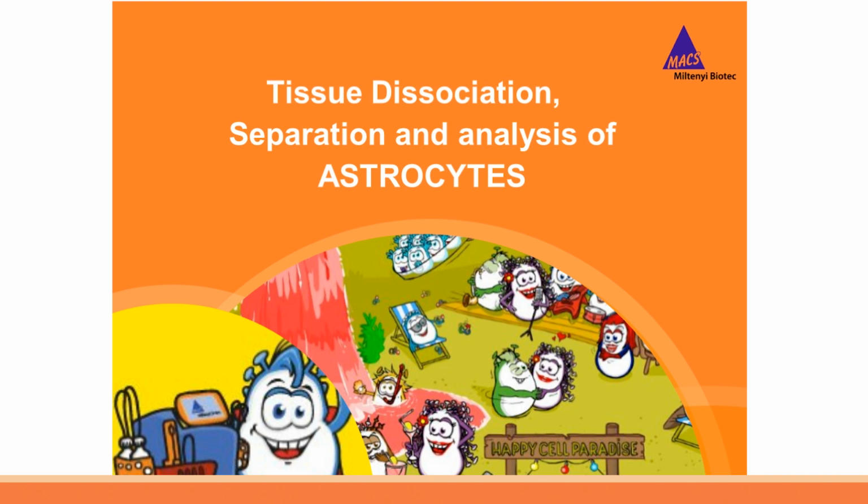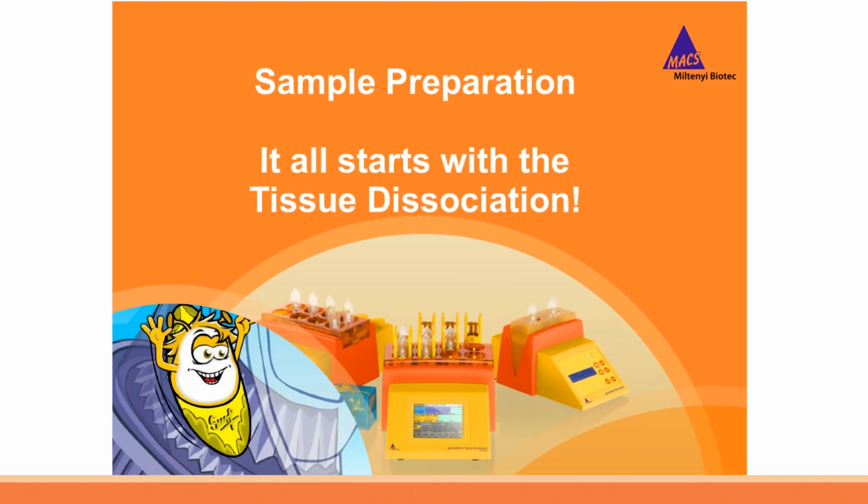In the next part, we will show you now how to dissociate tissue and give you more information on the separation and analysis of astrocytes. Before cells can be separated, the tissue must be dissociated, and the prerequisite for proper cell separation is really the sample preparation and the generation of a single cell suspension with a high percentage of viable cells and a minimum of debris. Therefore, a successful experiment really starts with a very well-prepared tissue dissociation.